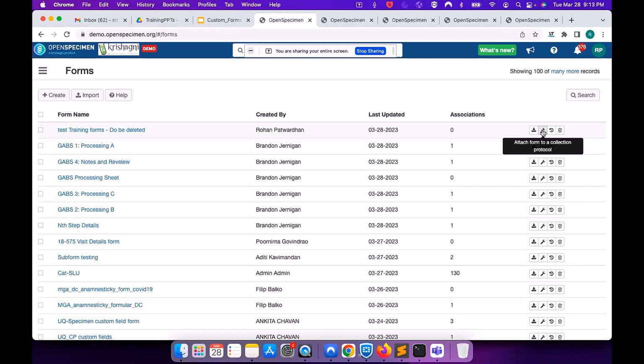Okay, so if we update them and switch over to new forms, then we won't be able to query the old forms. Yeah, that is right. Okay.